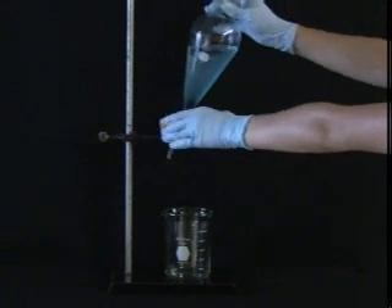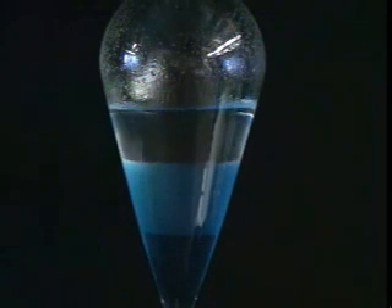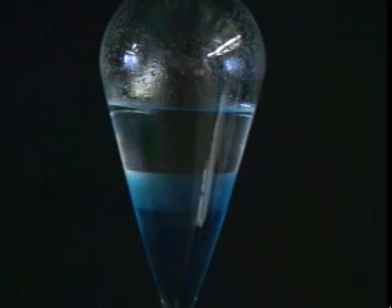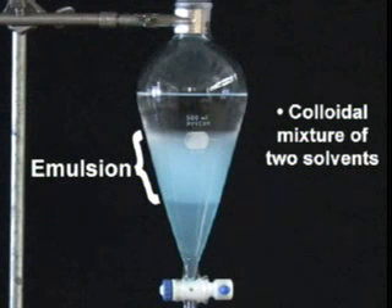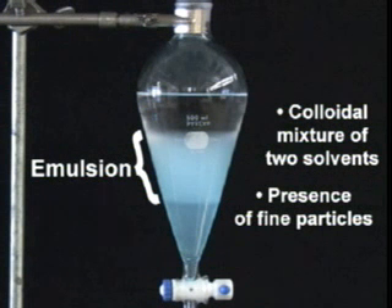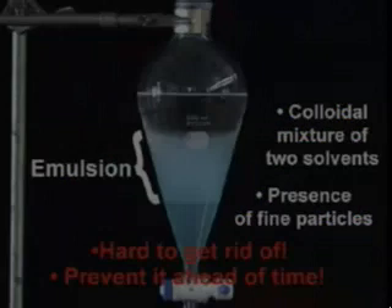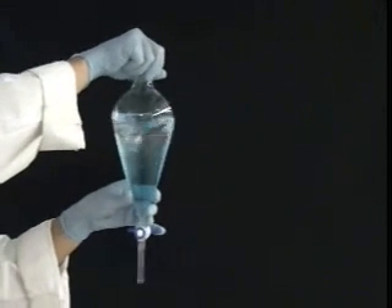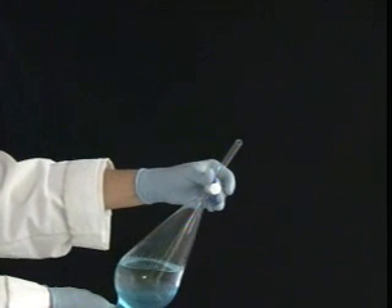Then set your funnel down and let the layers settle. Ideally, two layers with a nice, clean interface should form very quickly. Unfortunately, things don't always go so smoothly. A thick, cloudy layer called an emulsion can sometimes form between the two solvent layers. An emulsion is a colloidal mixture of the two solvents and is frequently caused by the presence of fine particles in the solution. If you know that you are likely to generate one, your best bet is to take pains to prevent it ahead of time. For example, gently swirling and inverting your sep funnel will rarely cause an emulsion to form, though you will have to spend more time mixing because swirling is not as efficient as shaking.